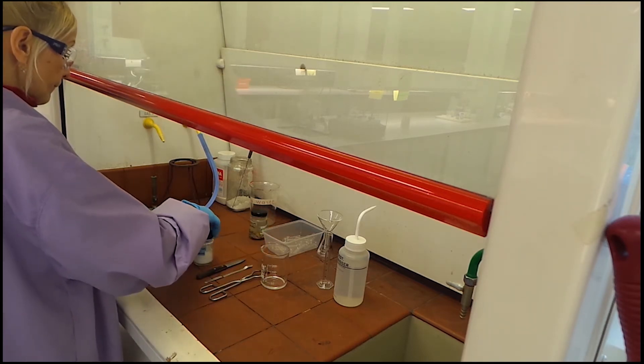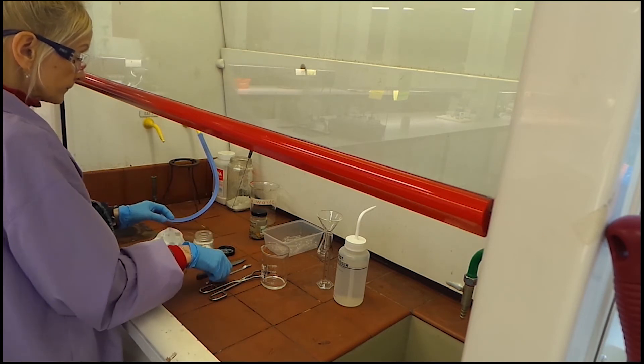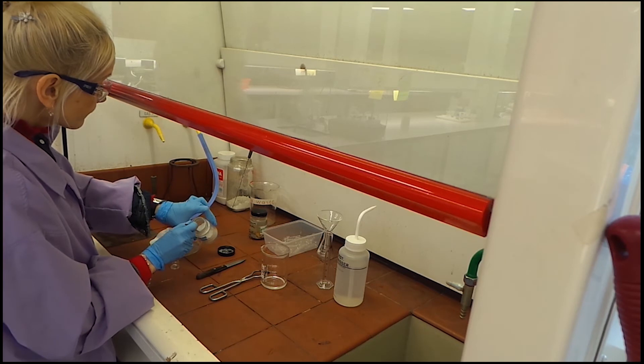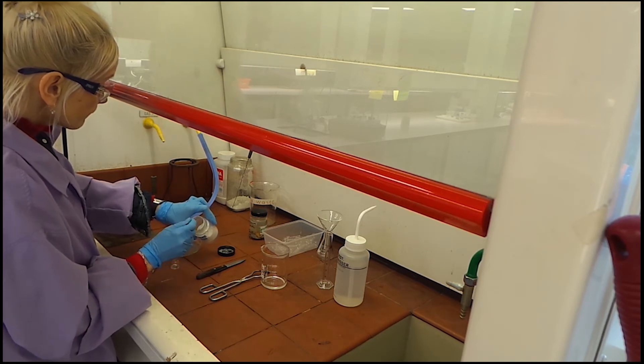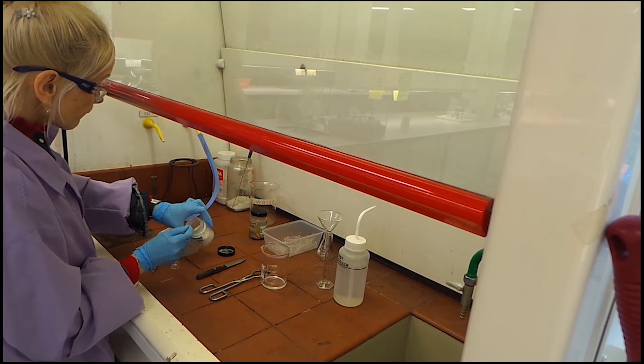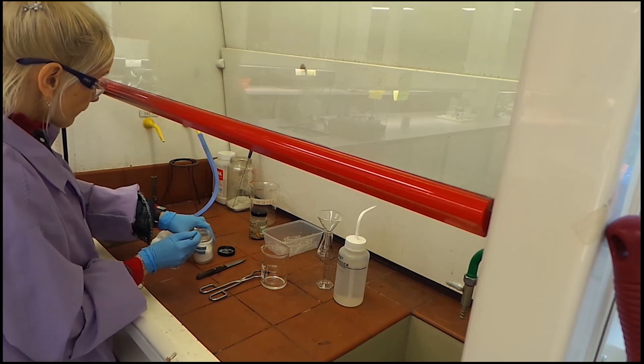Then add about 10 mg of your solid unknown using a spatula, or three drops of a liquid unknown using a Pasteur pipette into the ignition tube, being careful not to allow the unknown to touch the sides of the ignition tube.